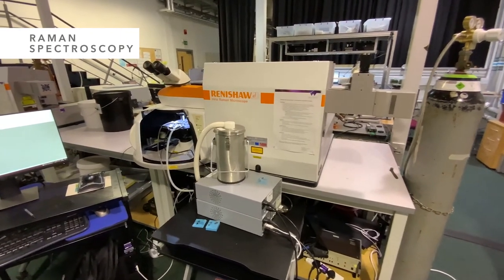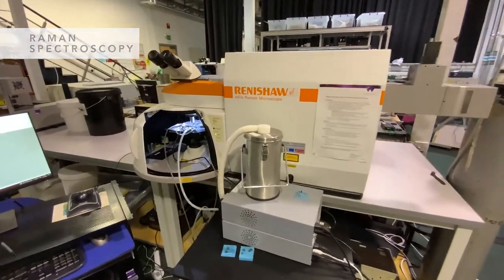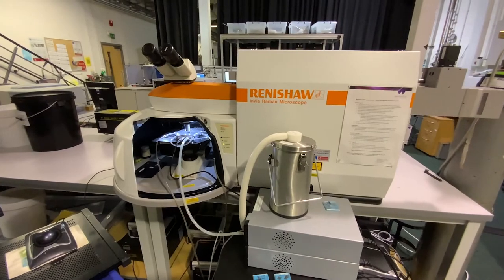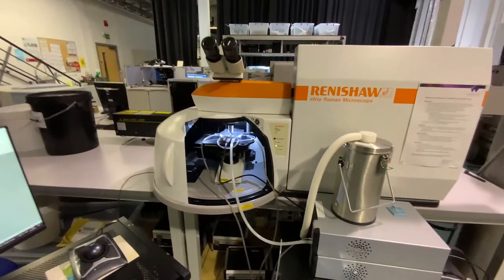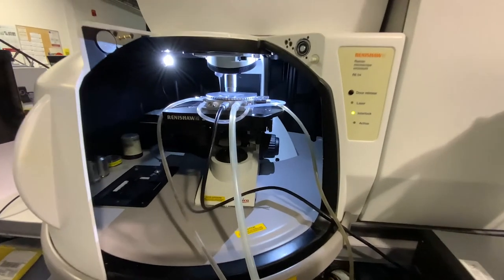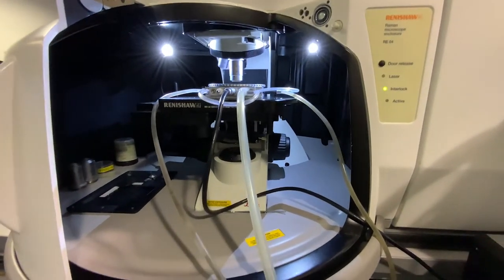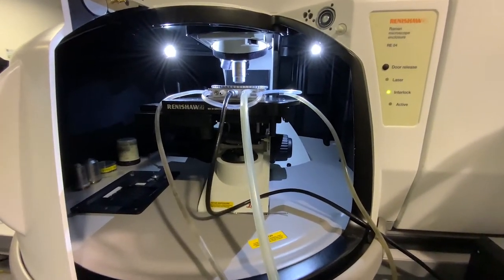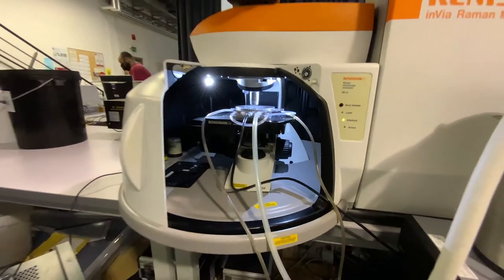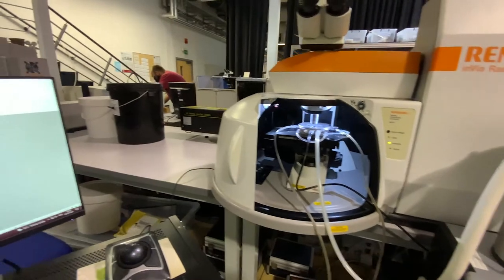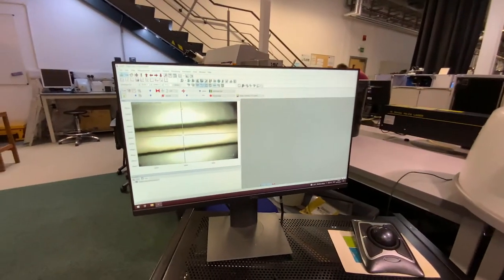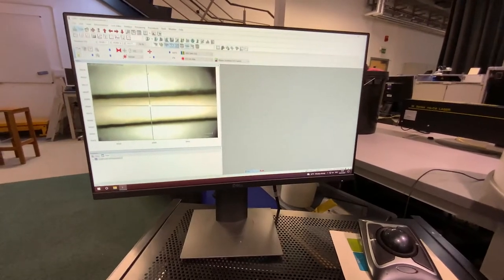First up, we have Raman microscopes. Raman measures inelastically scattered light to provide information about the chemical structure, phase and crystallinity of a sample. This can either be done in bulk or, with the aid of our microscopes, we can produce images of the distributions of material within a sample. We have four Raman microscopes in the lab. Between them, they provide excitation light from the ultraviolet to the near-infrared, all of which can be equipped with variable temperature stages.